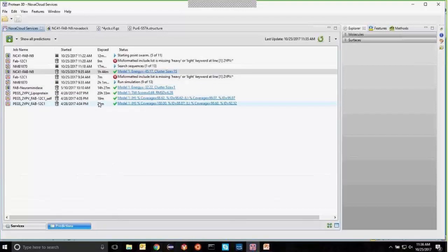It's because NovaFold Antibody is a dedicated workflow for doing antibody homology modeling. We use protein threading to select what we believe are the most appropriate structural templates independently for both the heavy and the light chain. We assemble the two so that they're in complex with one another. We graft canonical CDR loop structures onto it, and then we use either ab initio modeling, or what I think is a little more accurate, a template-based, fragment-based approach to loop modeling for the H3 loop. And then we do an energy minimization.